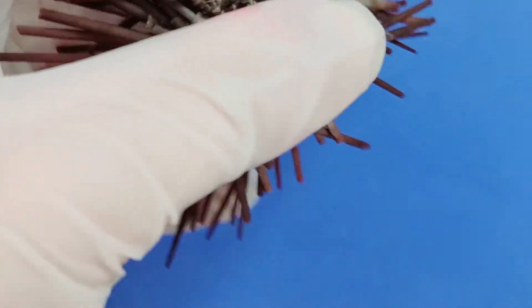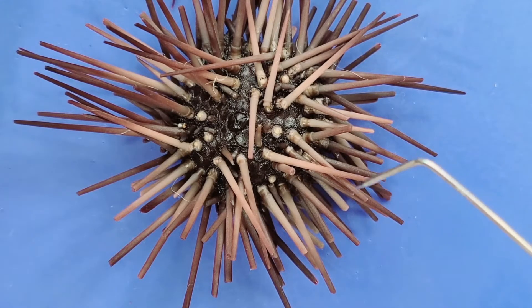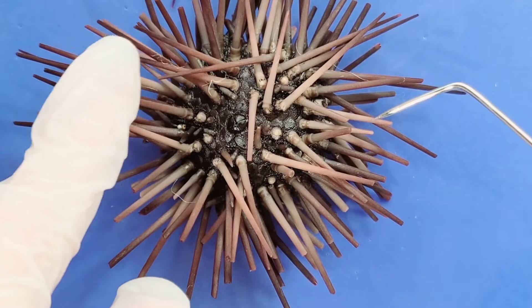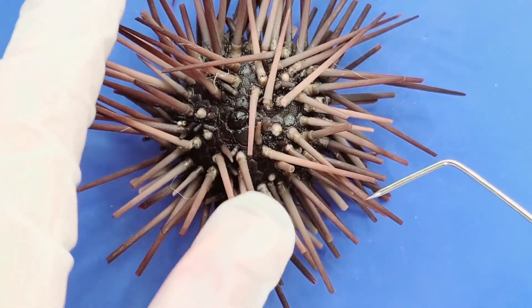The tube feet are also assisted by the spines, which help push the body along or lift the sea urchin off the substrate. These spines are attached to the sea urchin by a ball and socket joint, just like your shoulder joint — you can see how it rotates.